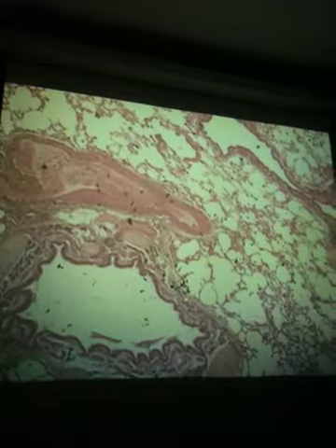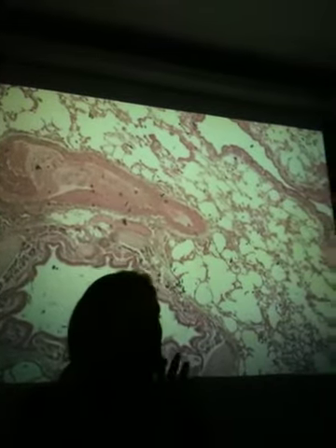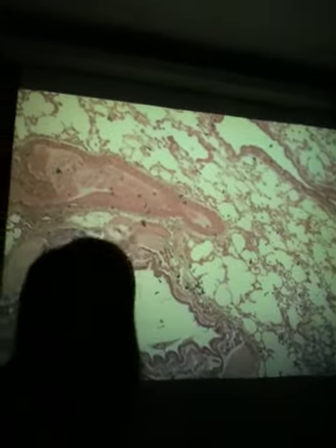Even though we know that they're all reversed in terms of whether they're oxygenated or deoxygenated, their actual structure is correct. So the arteries, just like regular arteries, will have a thicker media, and the veins will be much more thinly walled. Almost all of them, though, don't section real pretty, so we can't use the rule that it'll be circular if it's an artery or oblong. In order to really tell the difference, we need to see if we can identify either an internal elastic lamina or what we see in the walls.